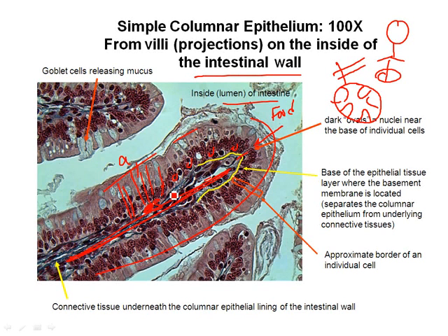Another thing you can see on this cell are called goblet cells. Let's spell this out, goblets. Like a wine goblet. And these are the goblet cells. Anytime you see these little white or clear cells, these are goblet cells. And they make mucus.